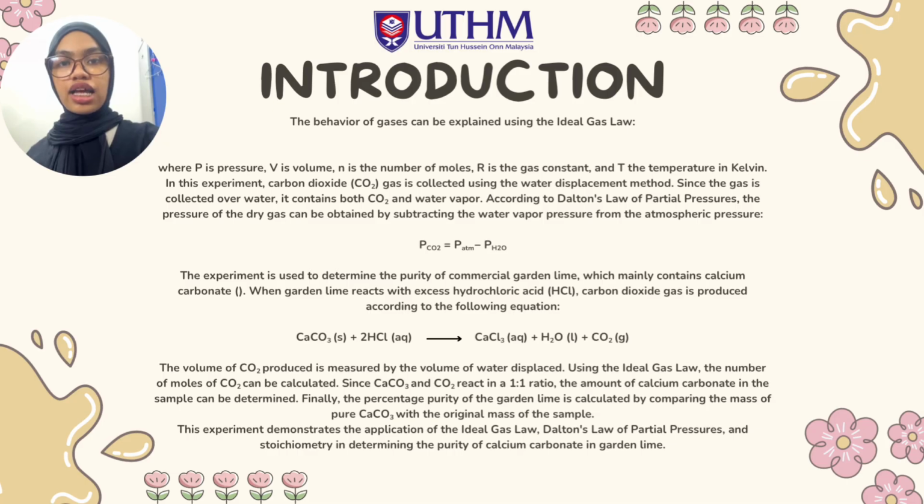As for the introduction, the behavior of gases can be explained using the ideal gas law, where P is pressure, V is volume, n is the number of moles, R is the gas constant, and T is the temperature in Kelvin. In this experiment, carbon dioxide, CO2, gas is collected using the water displacement method. Since the gas is collected over water, it contains both CO2 and water vapor.